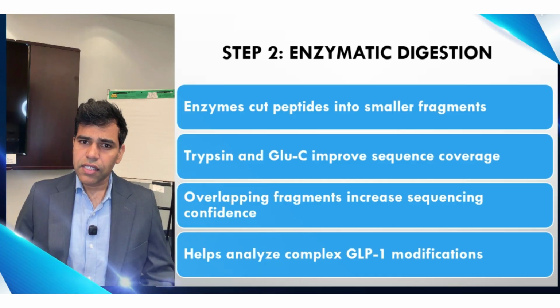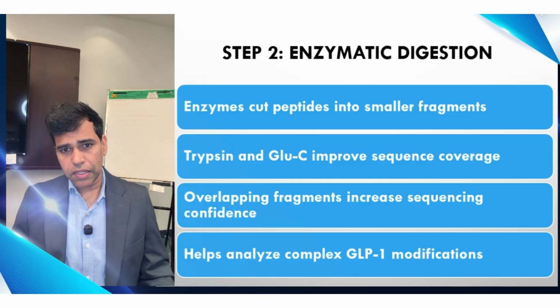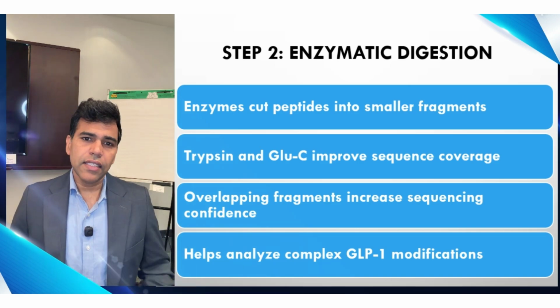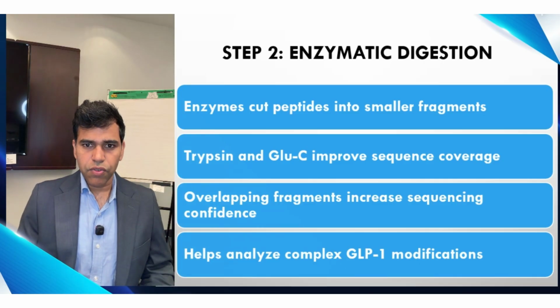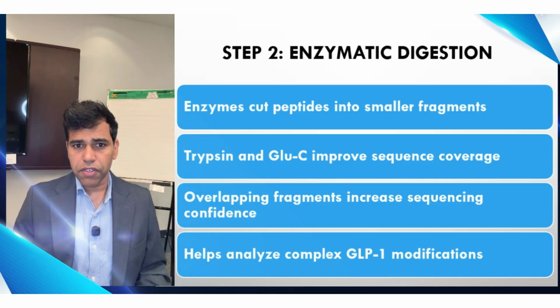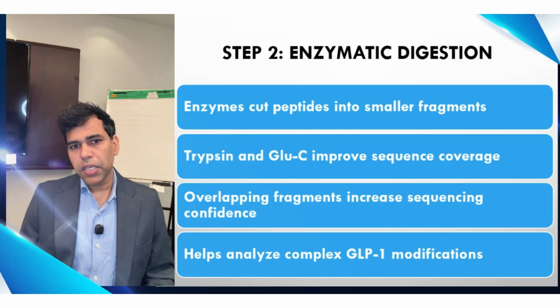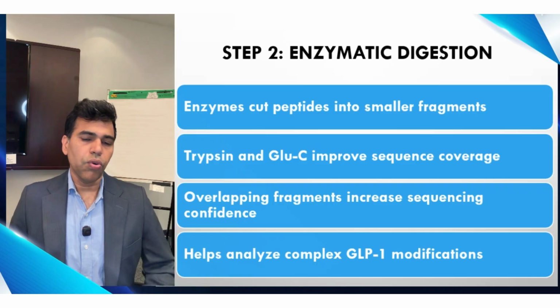The digestion strategy had left the last few amino acids unresolved. A second enzyme combination run in parallel from the start would have closed that gap in the first pass. It's the kind of detail that becomes obvious only after you have seen it go wrong.